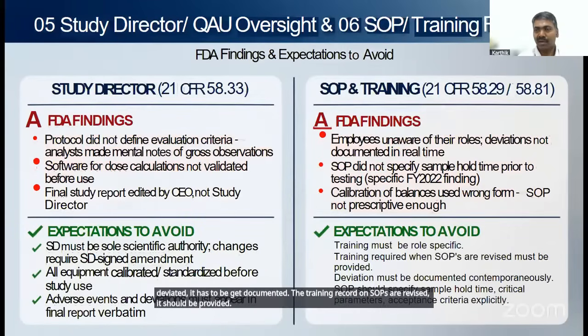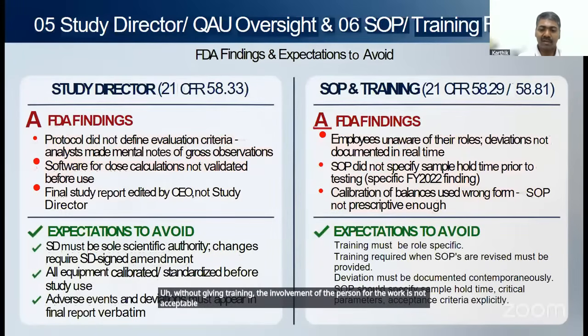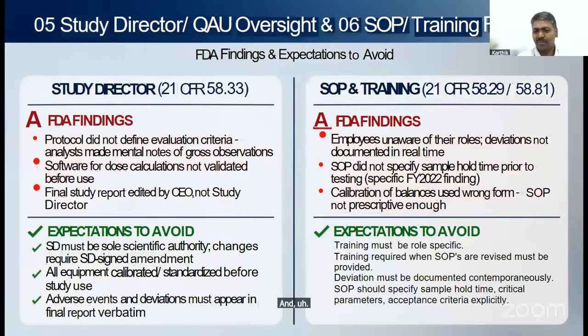Once after SOP training, without giving training, the involvement of the person in the work is not acceptable. Any SOP changes, it has to be trained before the involvement of the persons in those activities. And the SOP does not specify sample hold time prior to testing.